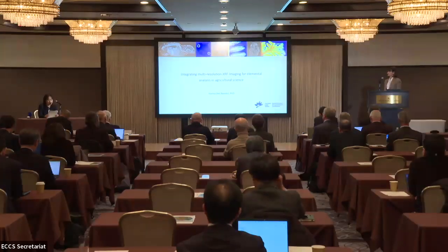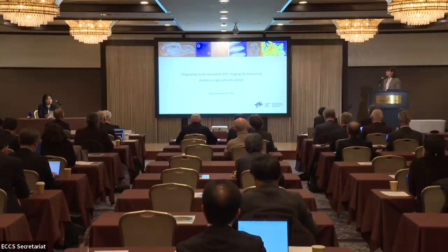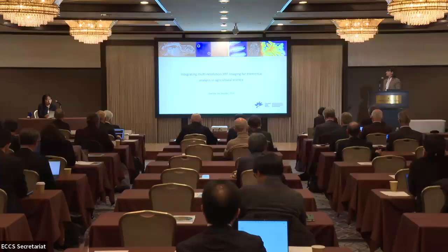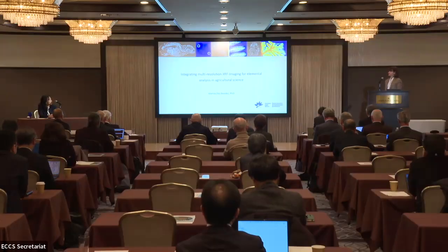Her expertise includes multi-resolution synchrotron-based XRF imaging, X-ray spectroscopy, and experimental design for complex samples, and she actively collaborates with diverse user communities to integrate the complementary synchrotron techniques. The title of her talk is Integrating Multi-Resolution XRF Imaging for Elemental Analysis in Agricultural Science.